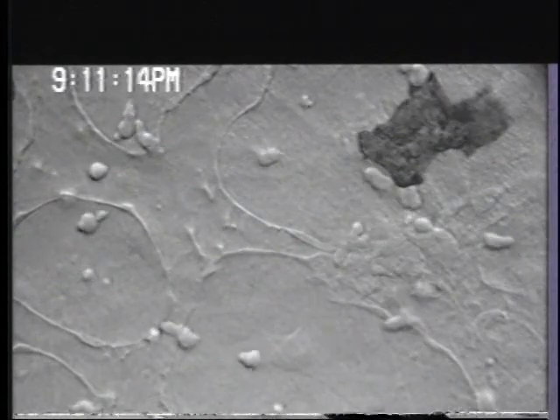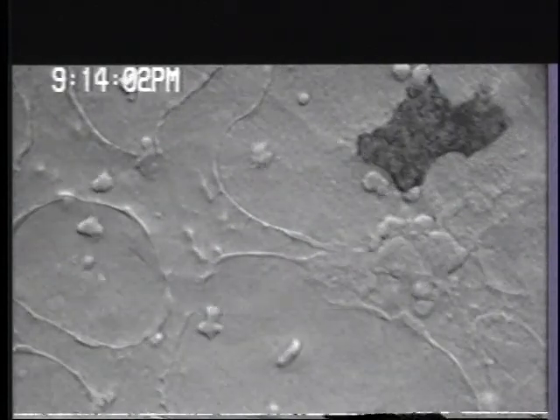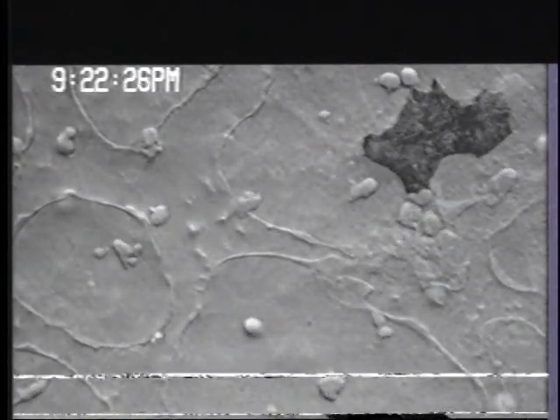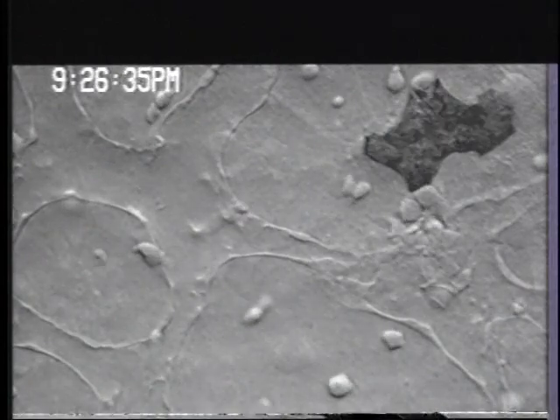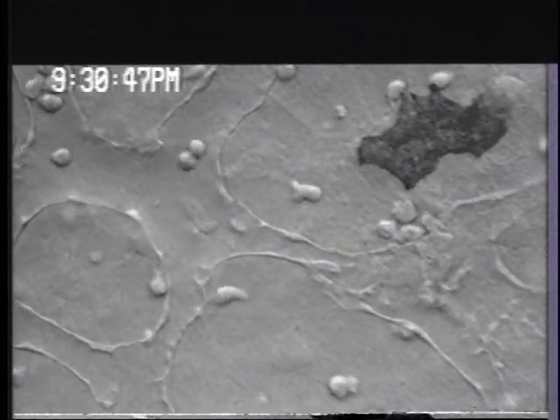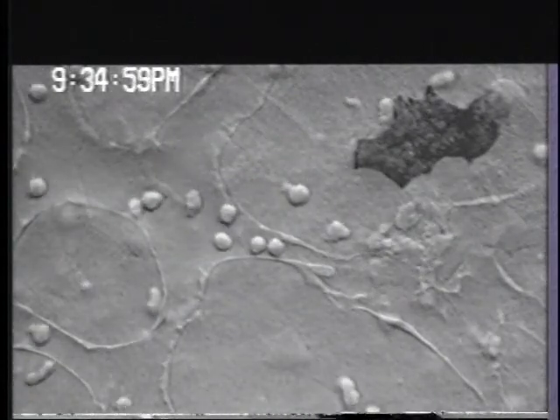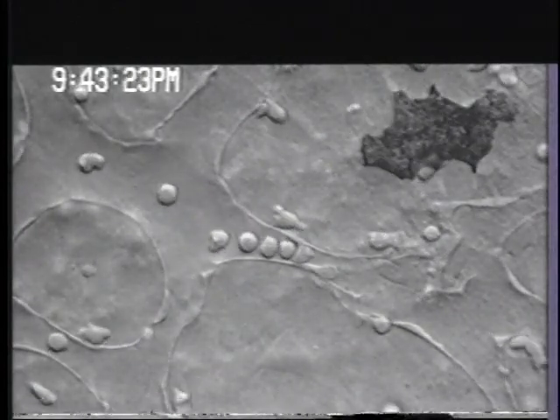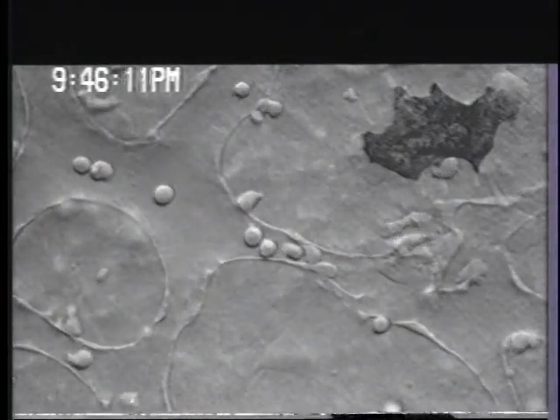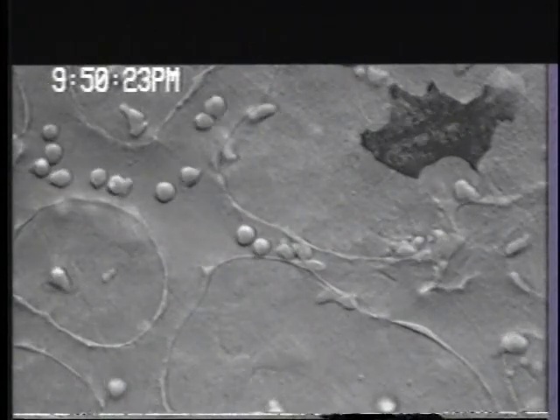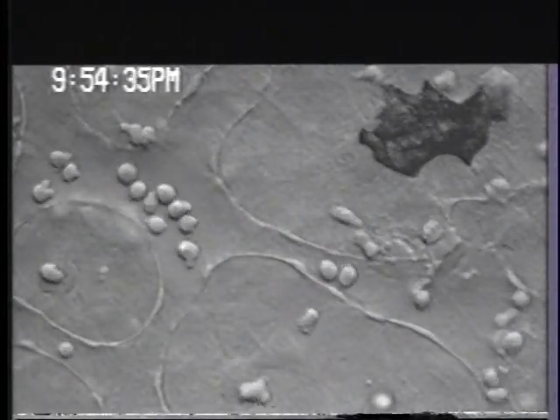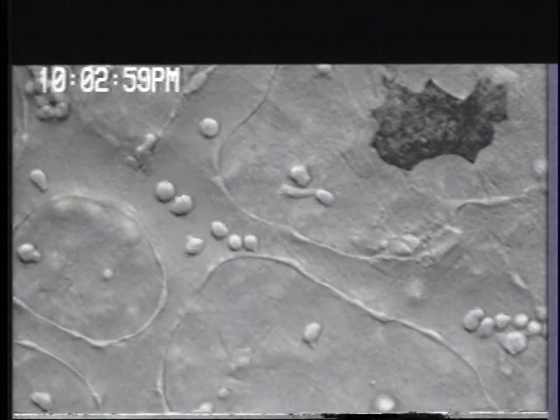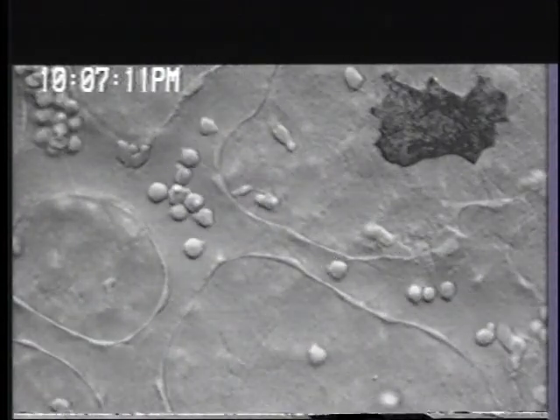As you watch, you can see the very first blood cells to be pumped through these vessels. A small group of blood cells appear to get stuck in an unfinished blood vessel in the center of the screen. The endothelial cells remodel and the vessel opens up. Unlike the more mature, flattened blood cells seen in the opening sequences of this video, these very young embryonic blood cells are rounded and often bleb. The time compression is 1 to 85.